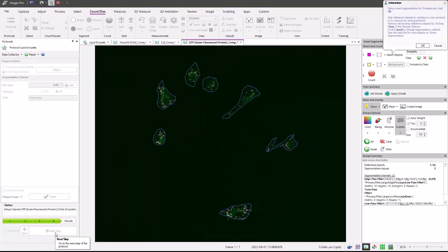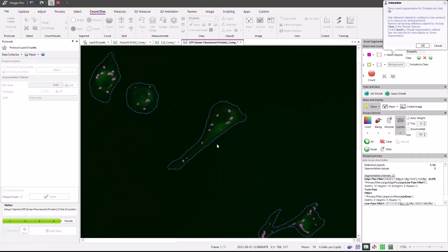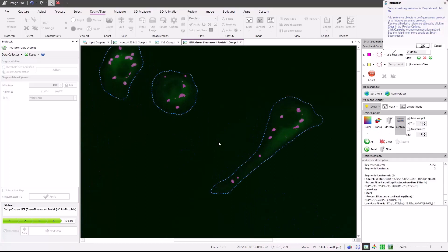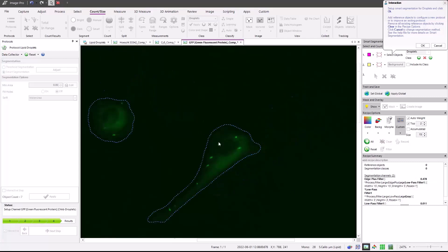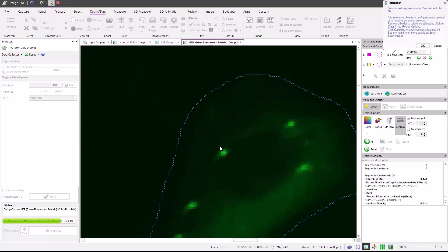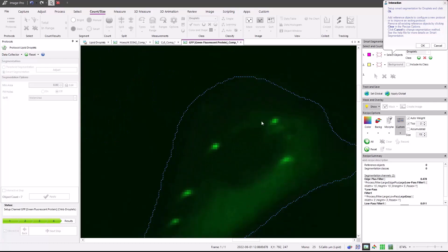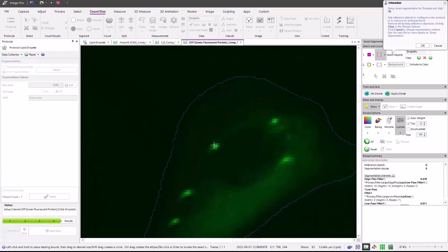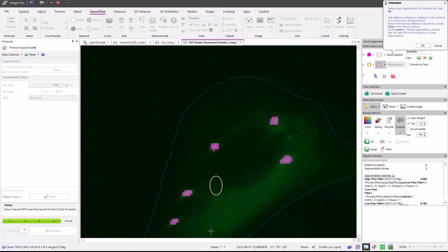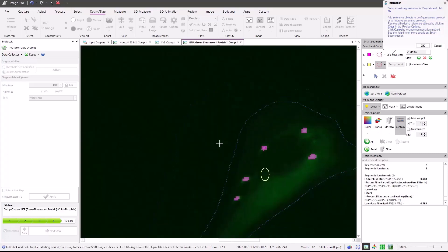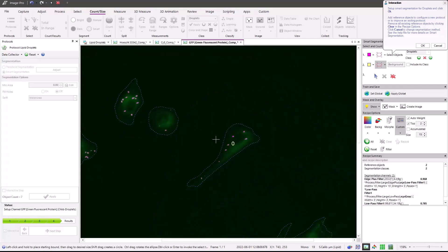And now we need to find the lipid droplets. For your own images, if they're not properly found, you can always come in and draw more reference objects to find droplets and background. And just to show an example, I can clear out the reference objects and come in and draw it again, finding the bright spots in droplets. And then I'll draw a background where droplets do not exist.